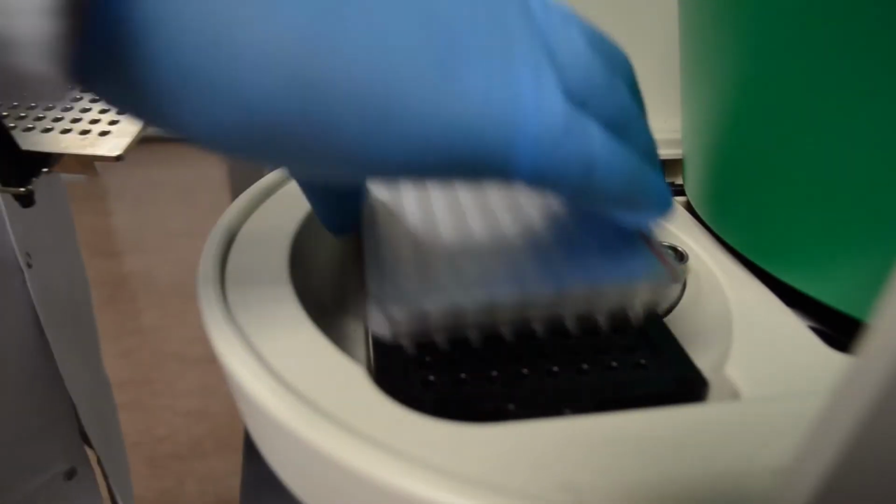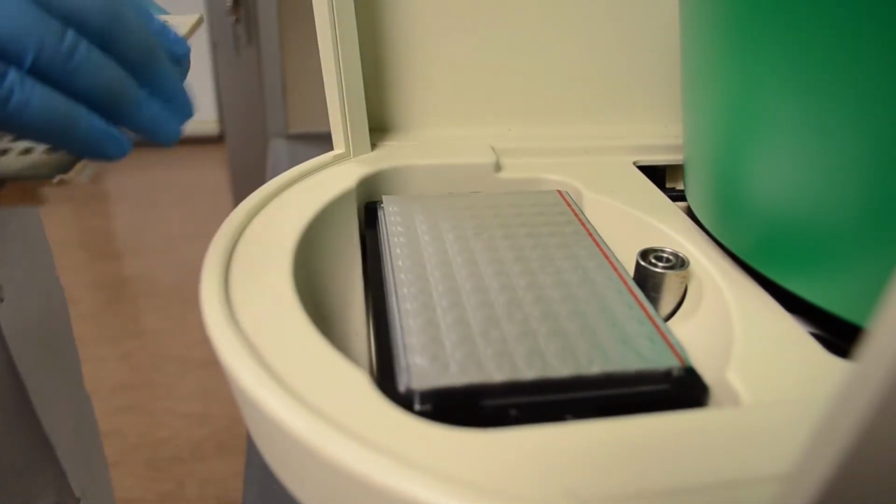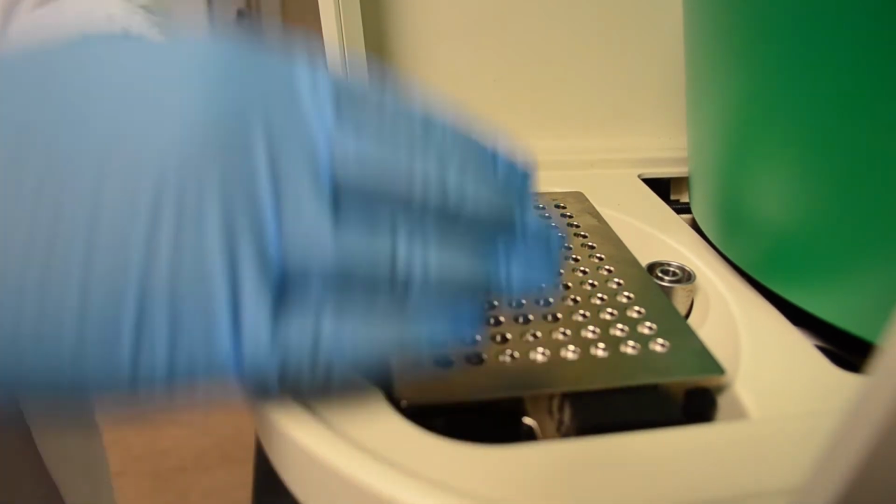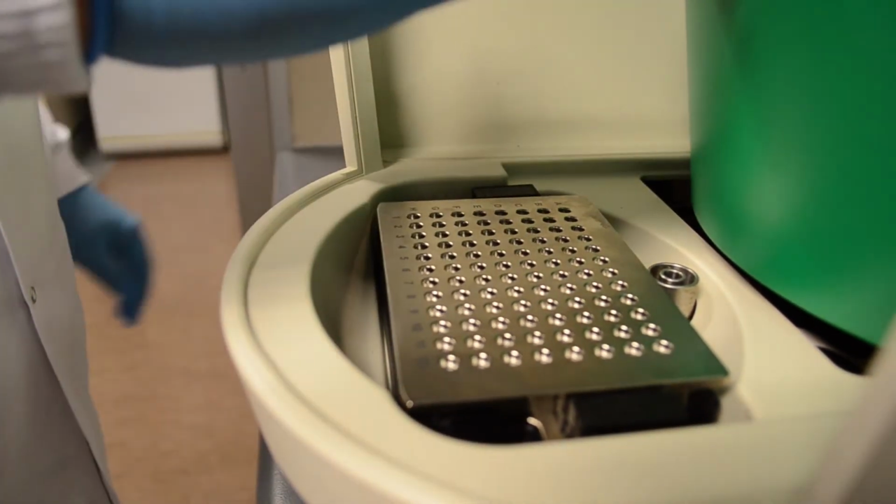So this instrument is a really powerful tool right now. It's called third generation PCR technology. I would suggest that you come and speak to some of the researchers at CRISP, and we can try and give you some advice on how this instrument can be used in your research projects.